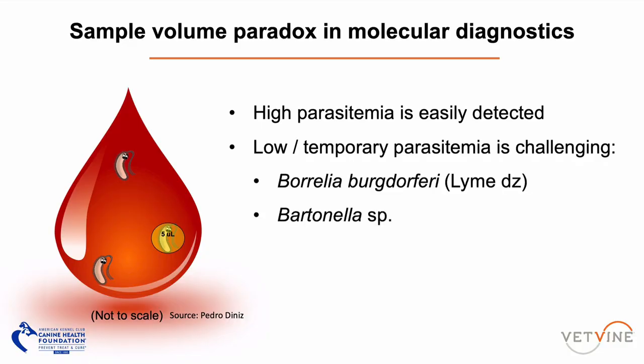A great example is Borrelia burgdorferi PCR. No one can recommend a blood PCR for Lyme disease nowadays because the spirochetes stay in circulation for only a limited time, then migrate to the tissue — really moving out of the capillaries and through the tissue. That's why we see clinical signs in joints, kidneys, etc. The best PCR for Lyme is a tissue biopsy of the bull's-eye lesion, because that's where the spirochetes are migrating. Blood PCR for Lyme is not a good diagnostic tool, but skin biopsies are excellent.